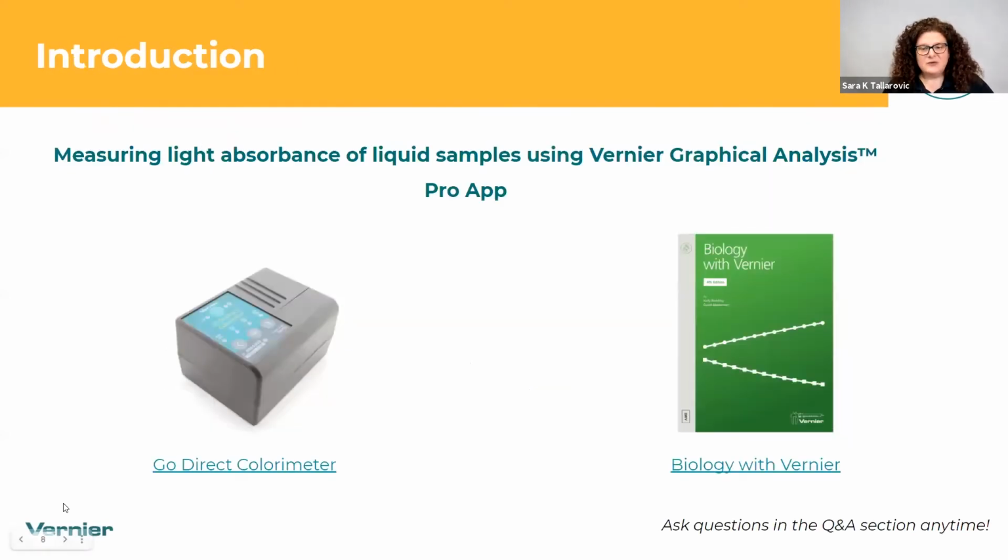All right, so the way that we're going to run it today is we're going to do the main prep out of Biology with Vernier, lab number 9, and we're going to use the GoDirect colorimeter.